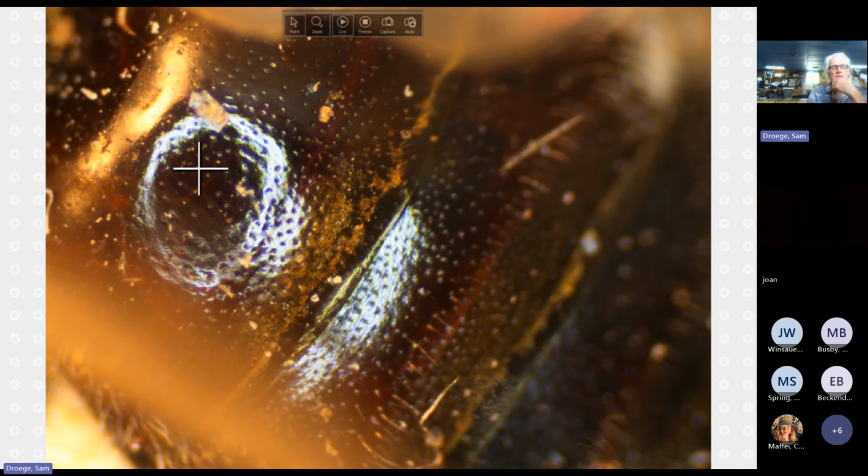So that's just one measure and it's clear. There is one other pit that is going to be the nearest one. What's that distance? Then take an average, which will give you a description of the average distance. And maybe if it's very variable you would want a standard deviation, but that's going beyond what most people are willing to do in terms of time. I don't think we're doing that level of detail. So does that make sense? I don't know what else you would do in terms of describing the distances between pits.